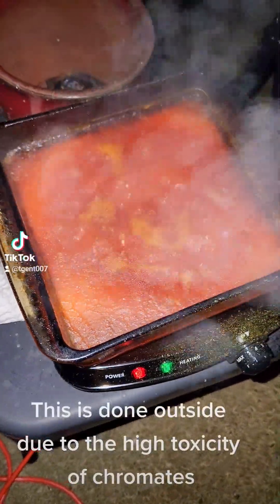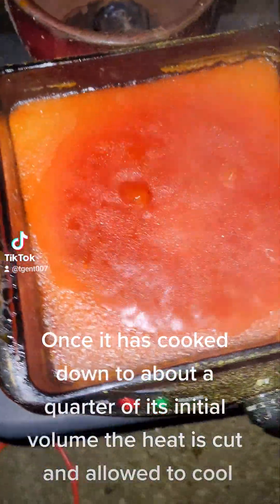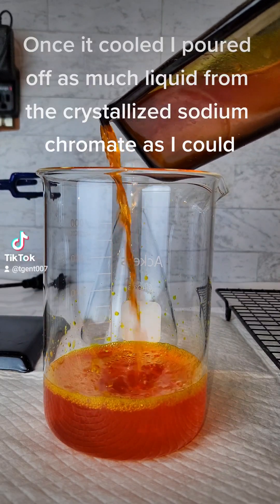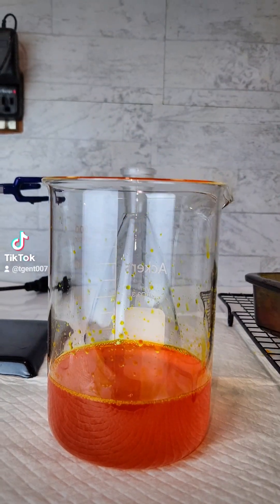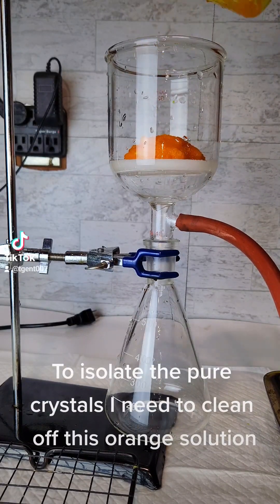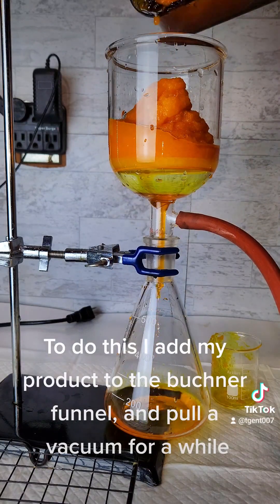Once it has cooked down to about a quarter of its initial volume, the heat is cut and allowed to cool. Once it cooled, I poured off as much liquid from the crystallized sodium chromate as I could. This left me with some very concentrated solution and a lot of crystal sodium chromate. To isolate the pure crystals, I need to clean off this orange solution, so I add my product to a Büchner funnel and pull a vacuum for a while.